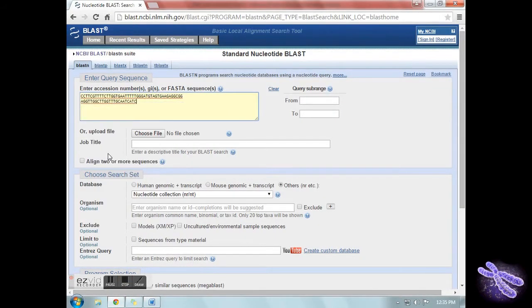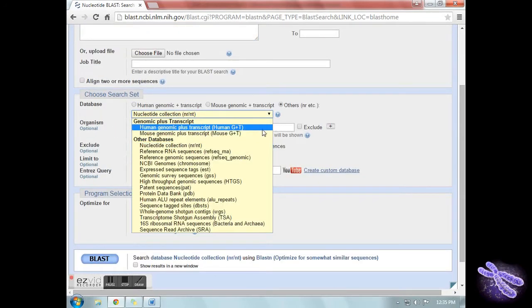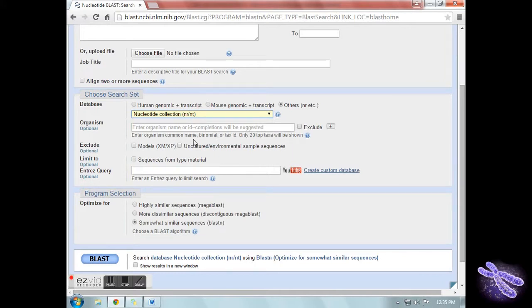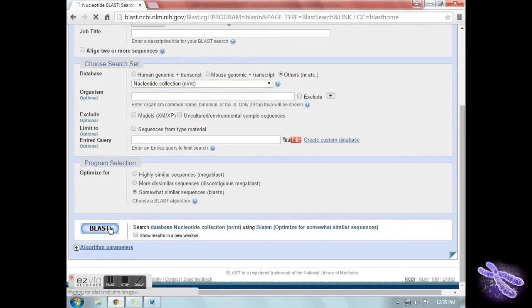Be sure to eliminate all non-nucleotide characters. Under Choose Search Set, select Nucleotide Collection. Under Program Selection, click BLASTN for somewhat similar sequences. Then click BLAST.